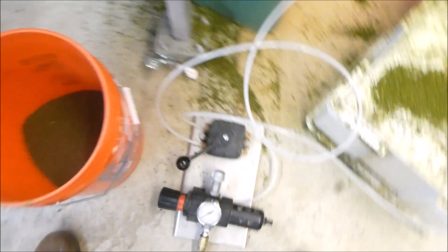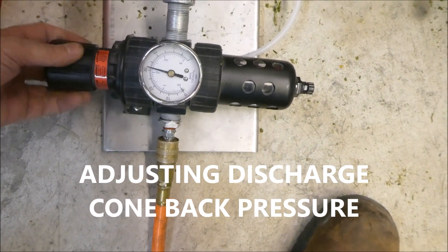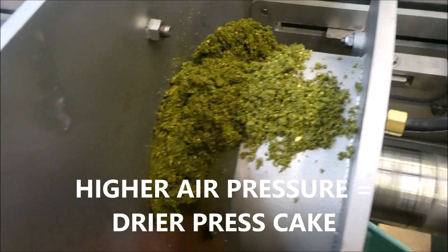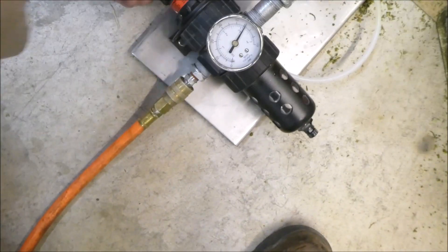Alright, we're going to increase the pressure now. It's running fine. I'm taking it up to 40 PSI now. Alright, we've got more squeeze on it. It's working well so I'm going to go ahead and go up to a good 50 PSI.